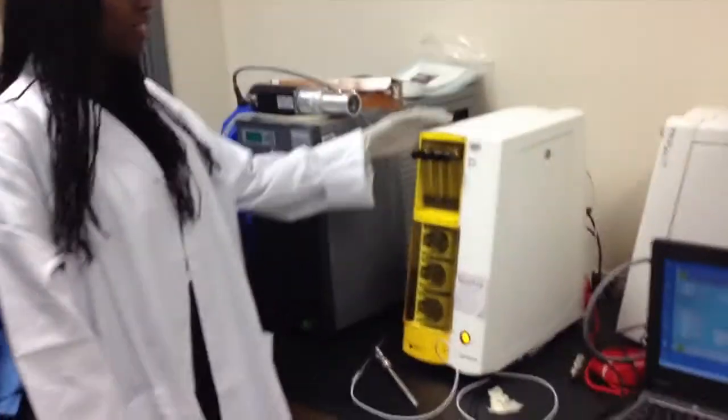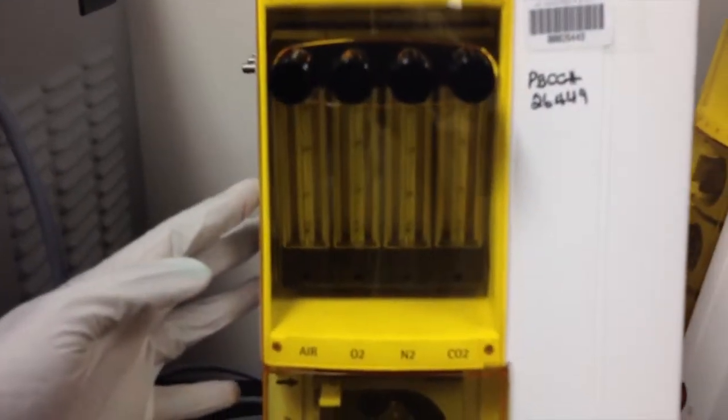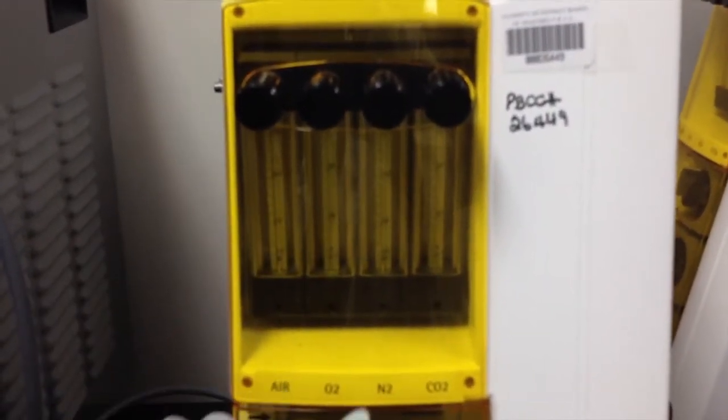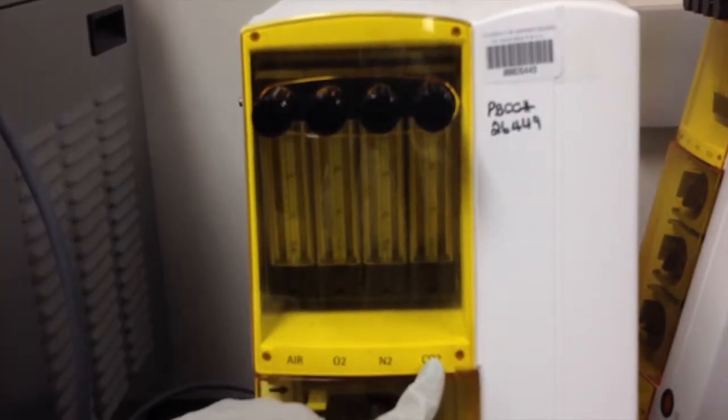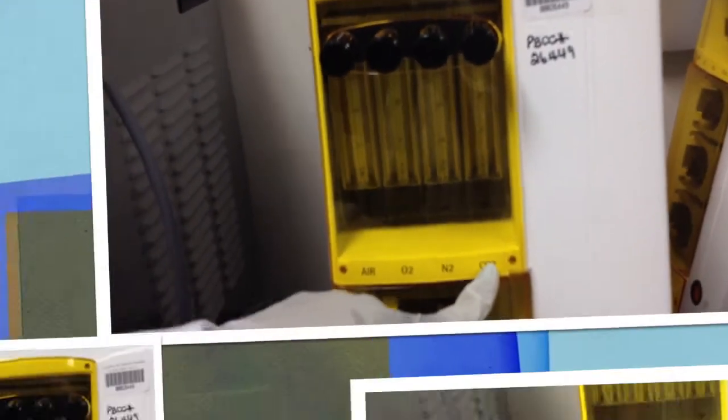Now that we're done explaining the bioreactor, we're going to explain the desktop. We're going to break the desktop into two parts. The first part is located right here, and this is used to maintain the levels of air, oxygen, nitrogen, and carbon dioxide, which are all components needed in cell media.